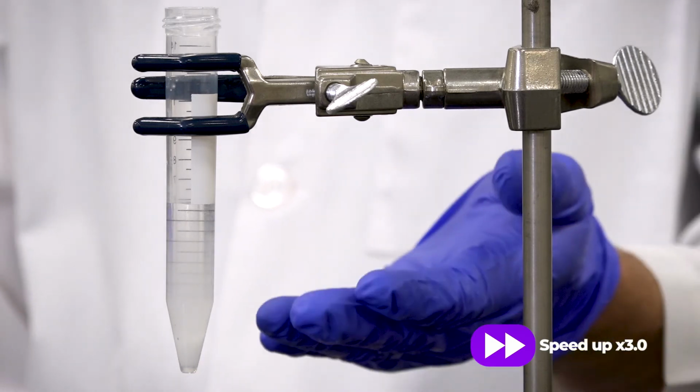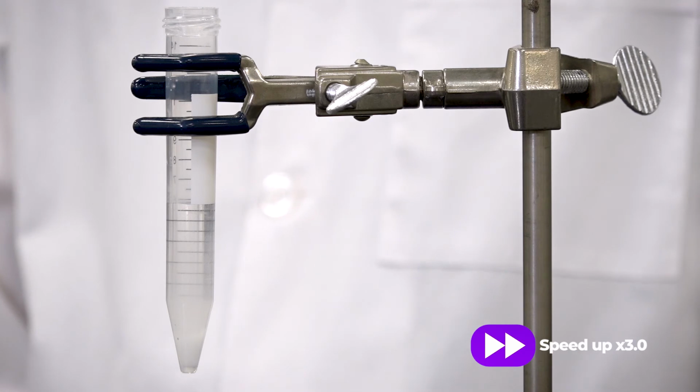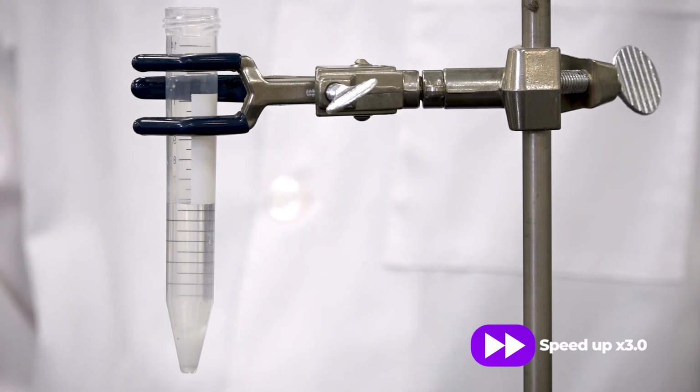So in just a short while, you'll notice that the sodium chloride crystals that precipitated in solution are now falling towards the bottom and forming precipitate in the bottom of the test tube.